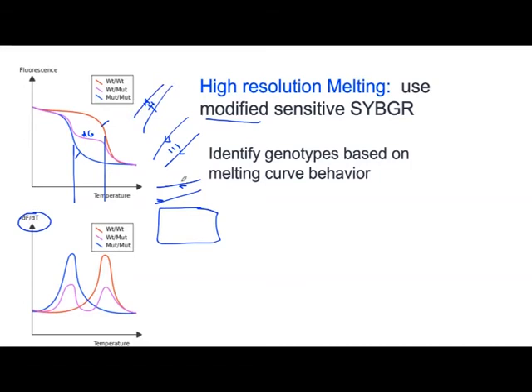It's not like any primers. And then each well, it will give you a graph. All you need to do is run 3 positive controls. The only thing you need in melt curve, in high resolution melting, is one sample which you know is the wild type, another sample which is heterozygous, and another sample which is homozygous for the mutant version.